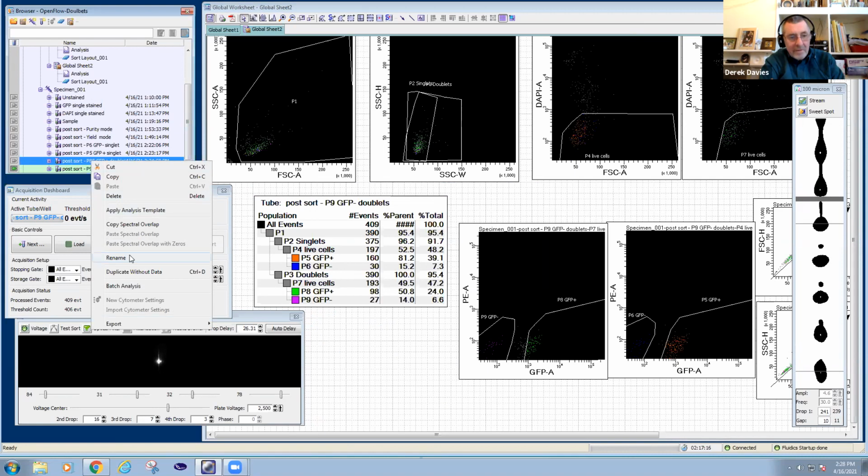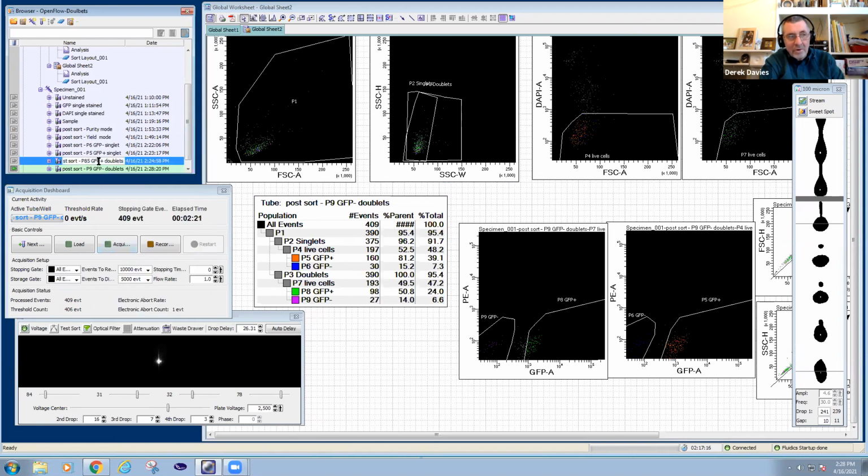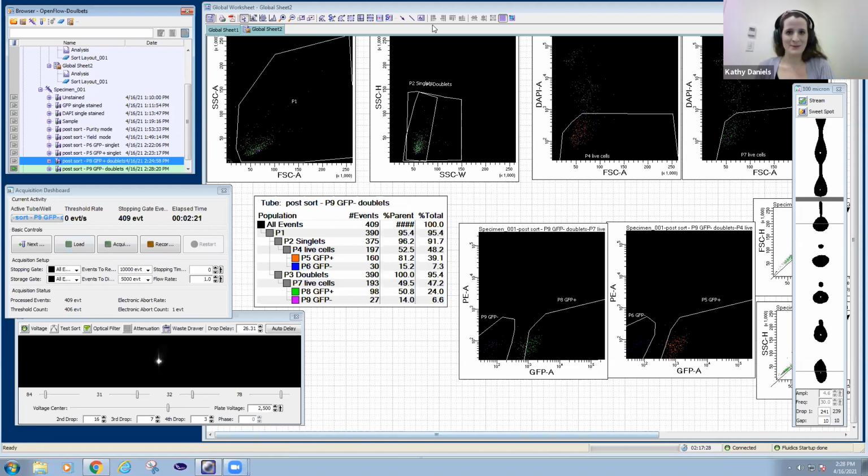One thing I think we may have mentioned in the previous one is if you are sorting into whole serum and you're going to rerun that as a sort control, be careful, it's full of nonsense. Yes, absolutely. Scatter will be all over the shop. Absolutely.